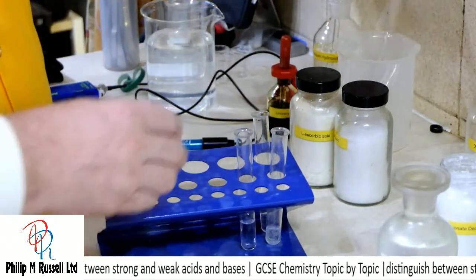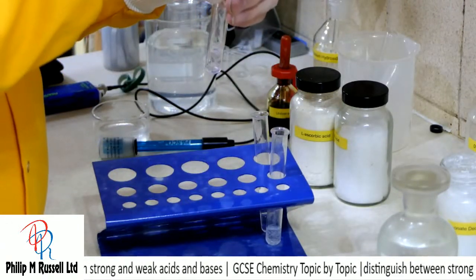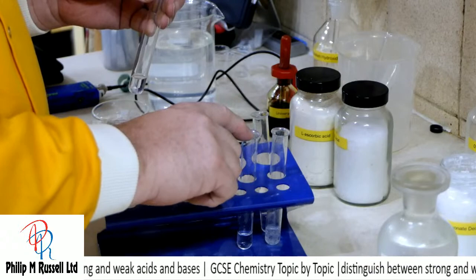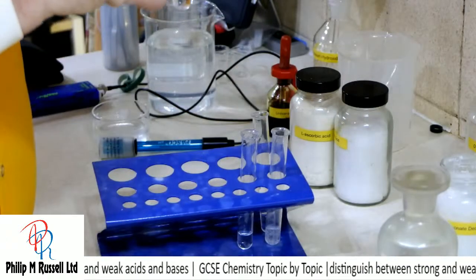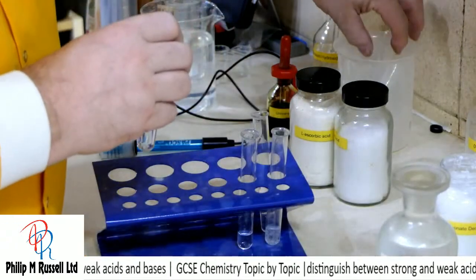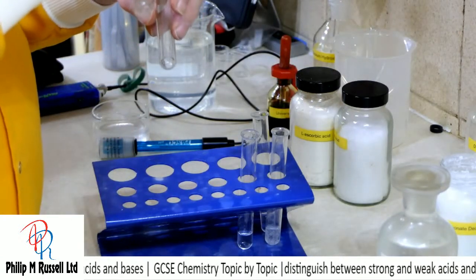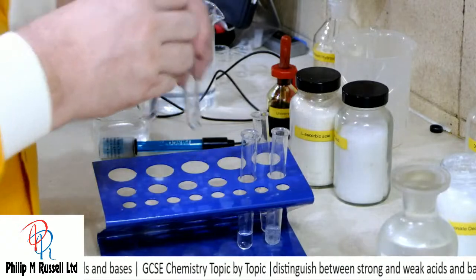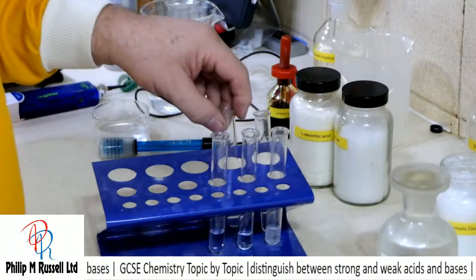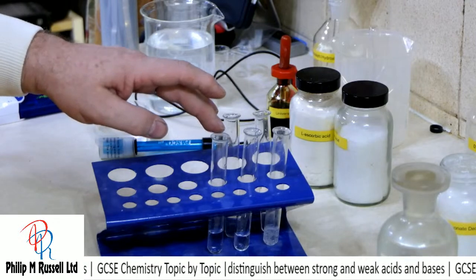Now we're going to cheat. 10 times dilution, let's put that one in here. So that's 1 molar, that's about 0.1 molar. Let's put in 10 centimetre cubed of water in here. And I'm starting to run out of test tubes. That is again more dilute. So we've got 1, 0.1 and then 0.01.